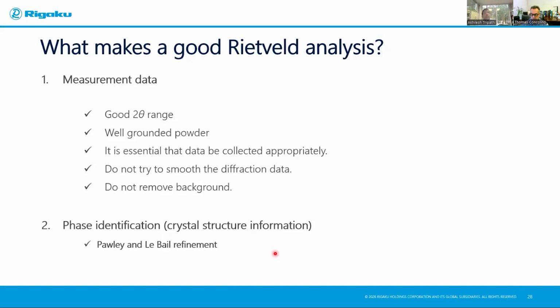It's constantly moving. So when you cannot, for a certain phase, out of let's say 6 phases you have, you mentioned you are using 8 phases, you have a montmorillonite phase, for example. Now, montmorillonite doesn't have a crystal structure. Then the refinement automatically shifts for that phase to a Pawley or LeBail refinement, which is refining individual peak intensities while fitting the full powder pattern without using structure. So for those, we are not using structure. That's why we said whole powder pattern fitting.